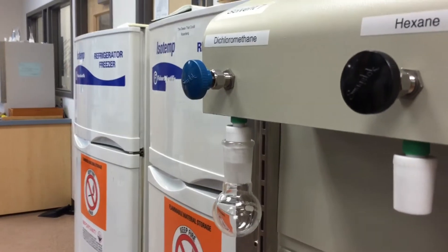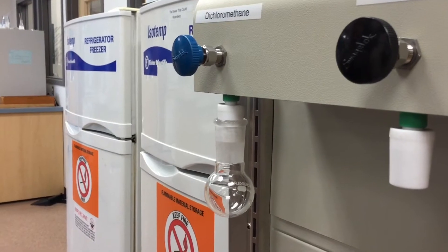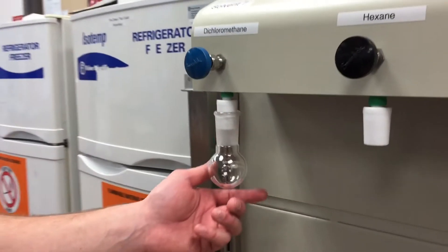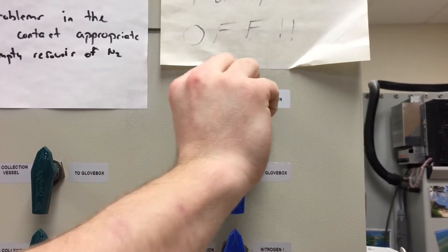Then we will wait another 30 to 60 seconds, allowing the vessel to evacuate. We will repeat this procedure again — turn the black knob to nitrogen and then back to vacuum.